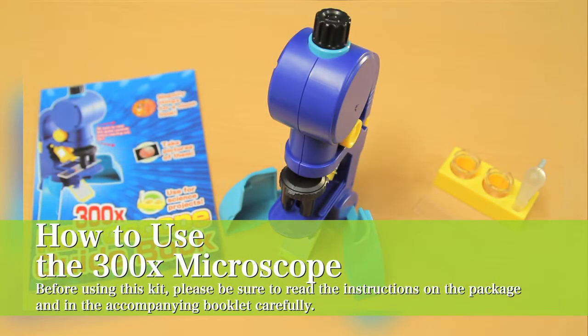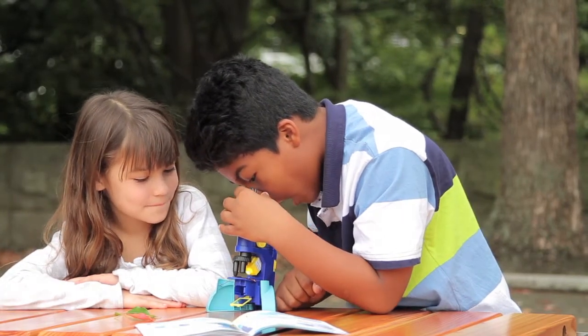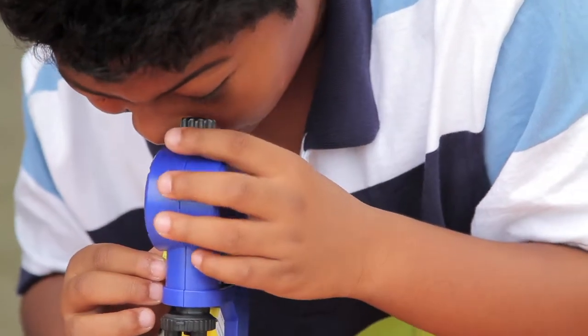How to use the 300x microscope. Using the object lens, you can see things at 50, 150, or 300 times their original size.